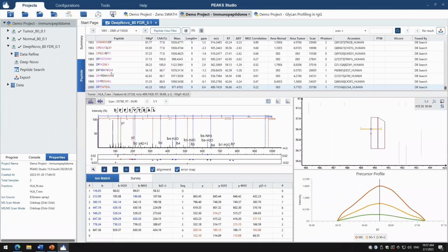And then in the peptide tab, again, you'll have your list of all peptides identified in the workflow, but we have this found by column, which will tell you whether it was, say, in that canonical group that were identified in a database search. But we'll also list peptide homologs or DeepNovo peptides in this column as well, and it could be sorted accordingly.